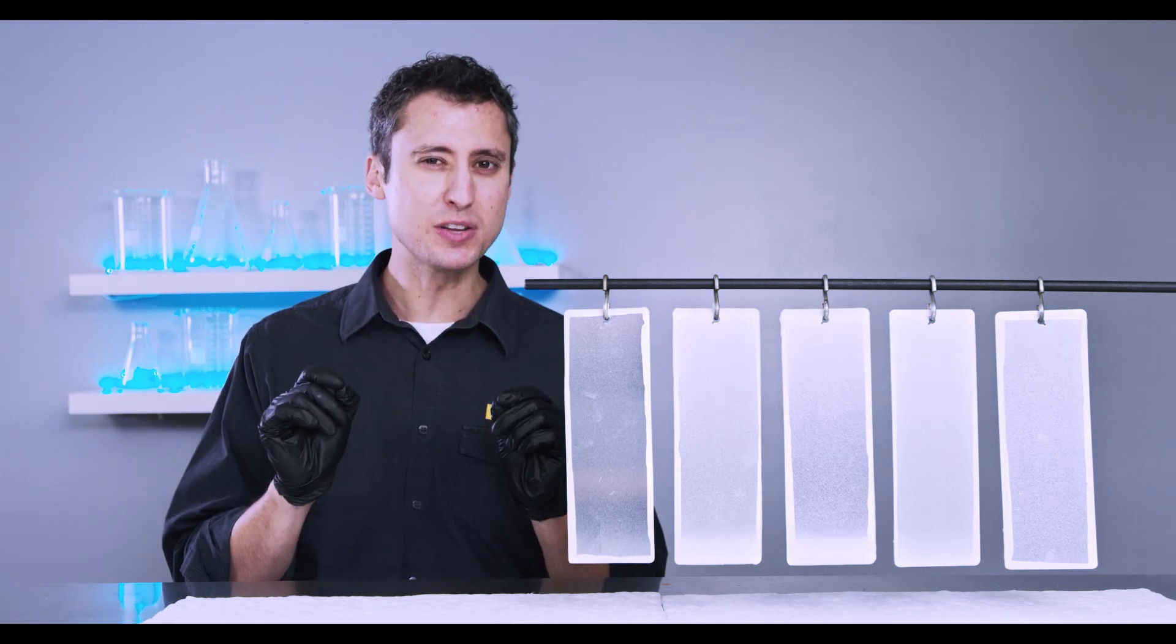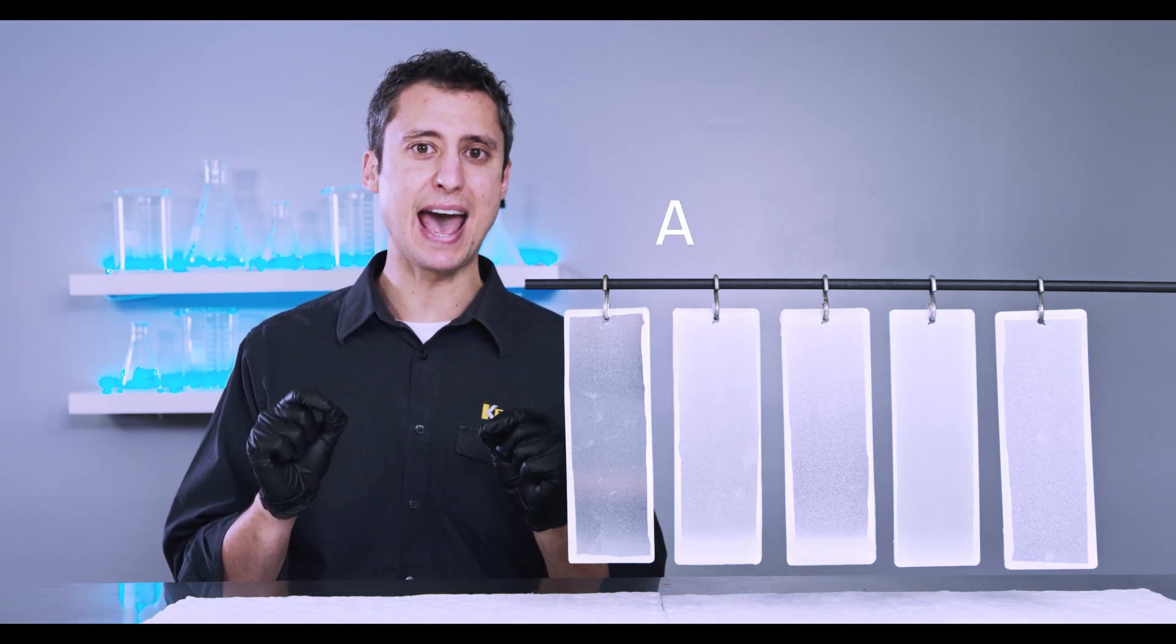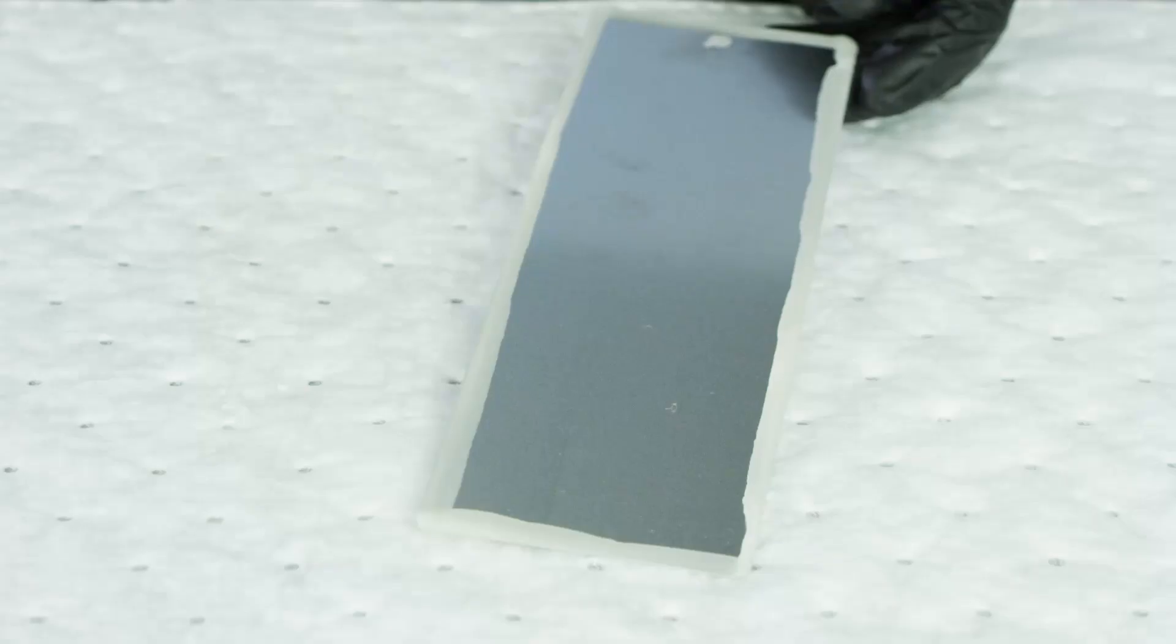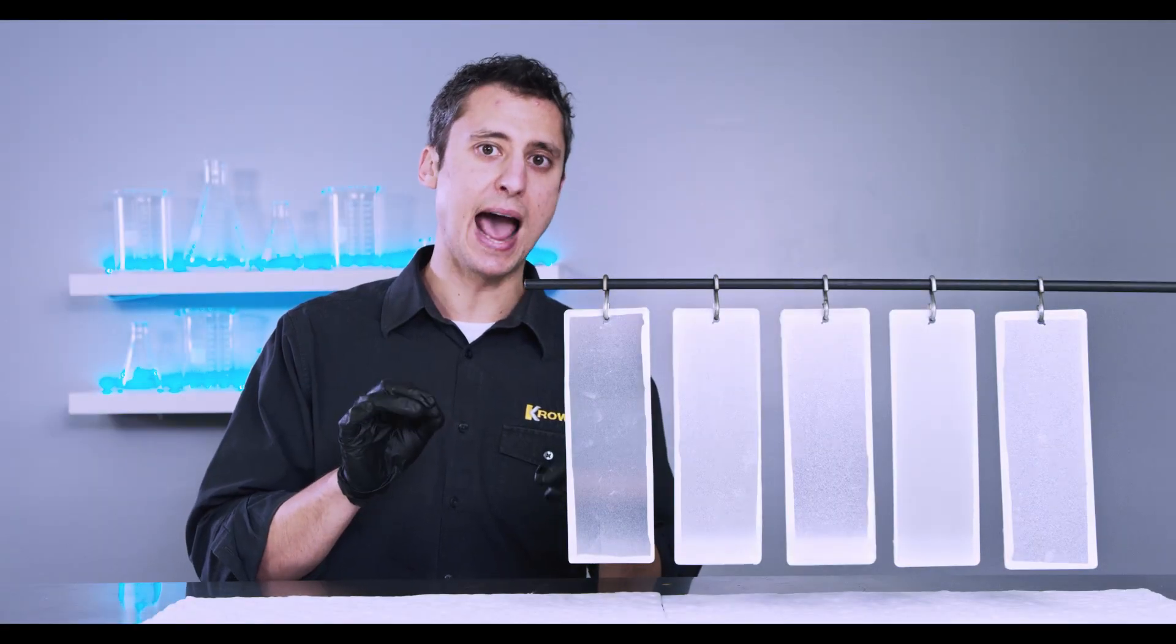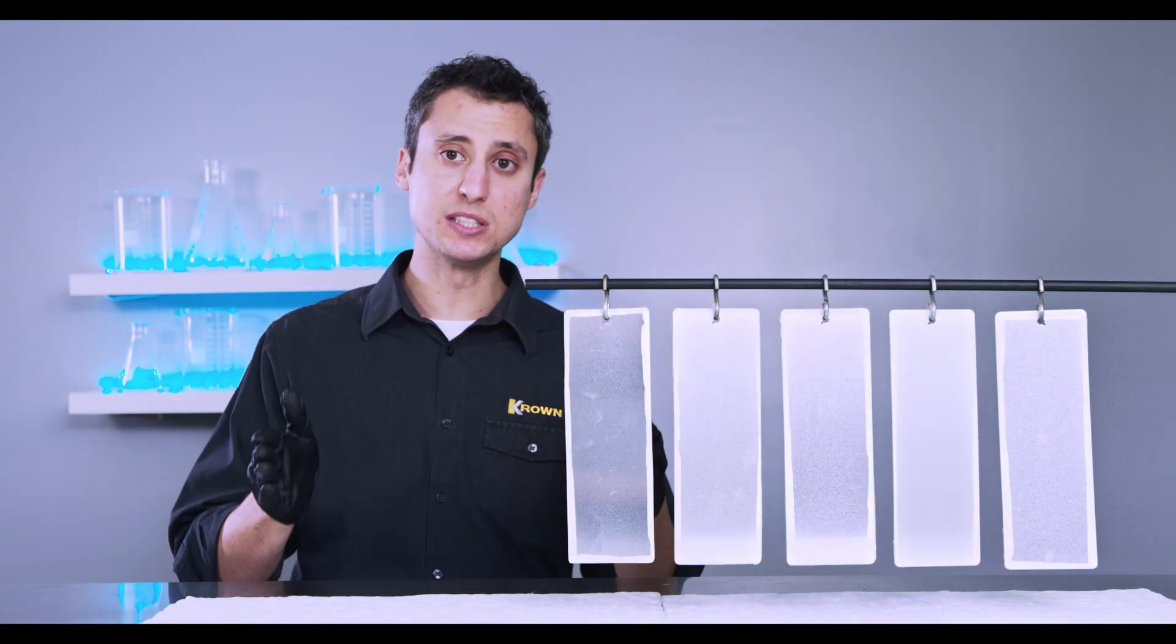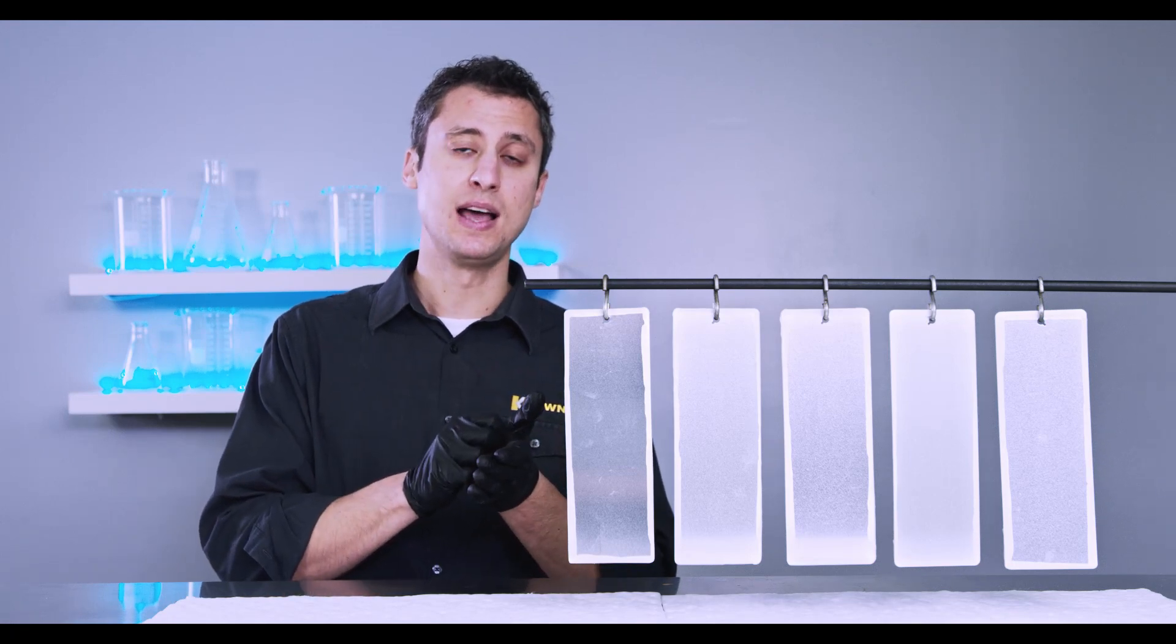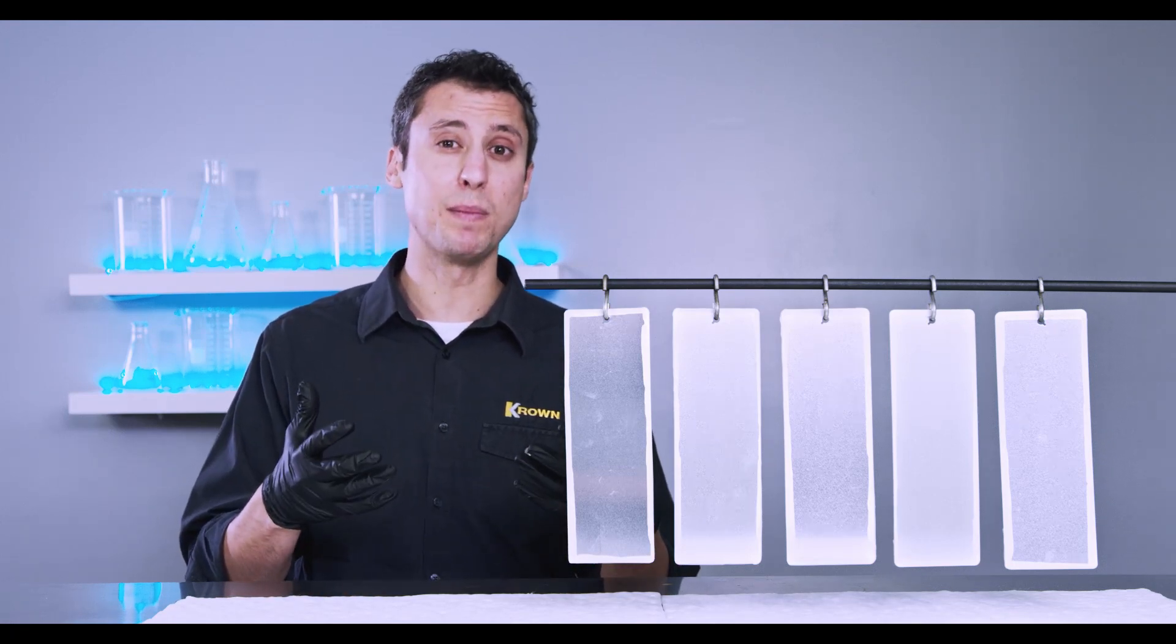To make sure that we meet the specifications of the ASTM B117 test, you'll notice that we have applied a hardened wax to the edges of the metal and what this does is it actually prevents any sort of corrosion that could form on the edges from bleeding onto the surface of the metal and therefore potentially compromising the results.